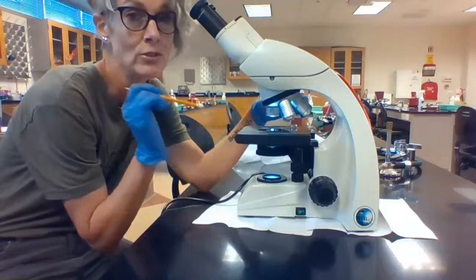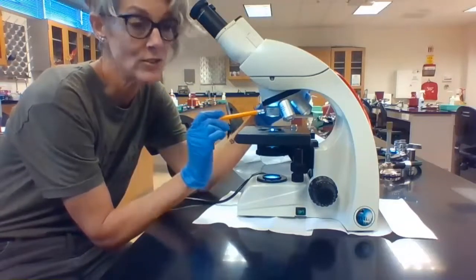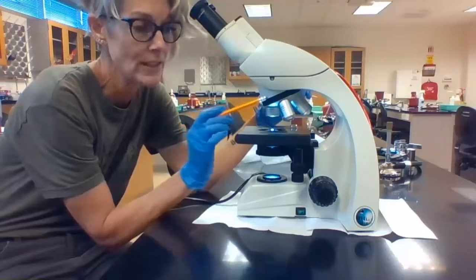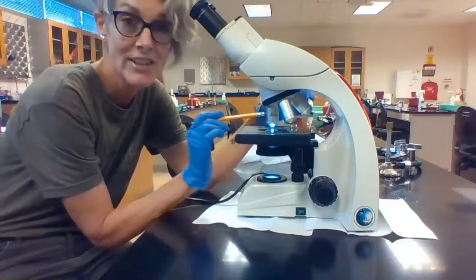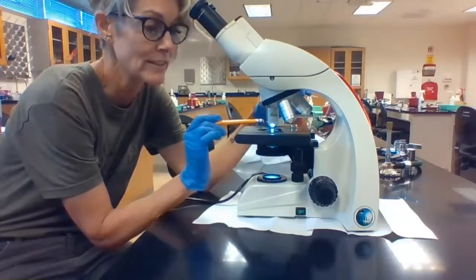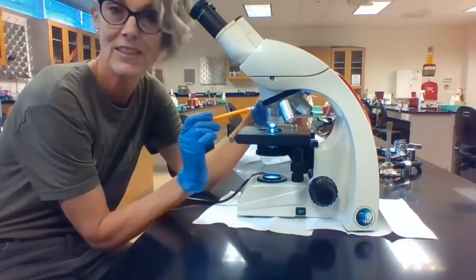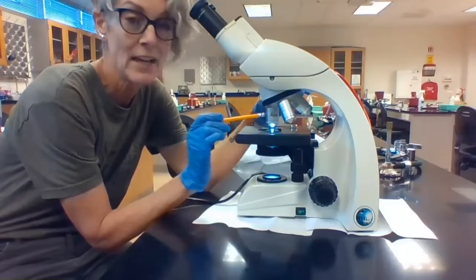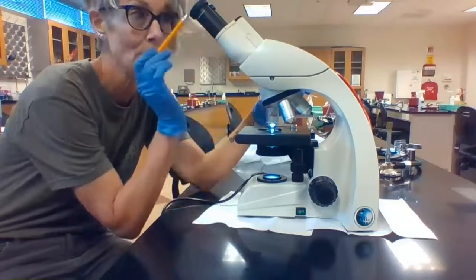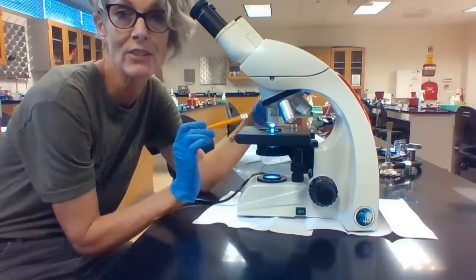For this class, mostly what you're going to do with the scanning objective is just find where your specimen is. To get to the next lens, you're just going to rotate the revolving nosepiece. Our next lens has a yellow band on it; this is called the low power objective lens. It has a magnification of 10x. 10x from this low power objective plus 10x from the eyepiece gives us a magnification of 100x.